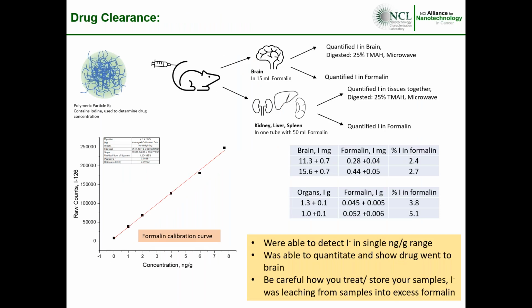So using this particle, we had another animal study as well. Our client was concerned with 2 things. One, they want to know if this nanoparticle is going into the brain. And for them, that's really good news if it is. That's what they're trying to do. They're trying to get this particle into the brain to help image and treat brain cancers. And I just want to know if this nanoparticle is being excreted and how much.